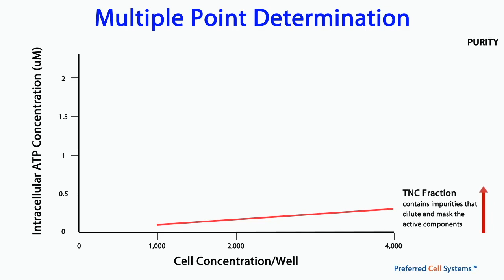Don't forget, this assay uses the most sensitive readout available, namely ATP bioluminescence, which is more than 5,000-fold more sensitive than any CFU colony readout. This means that if the ATP readout is low, it will be almost impossible to detect any statistically relevant results in the CFU assay.